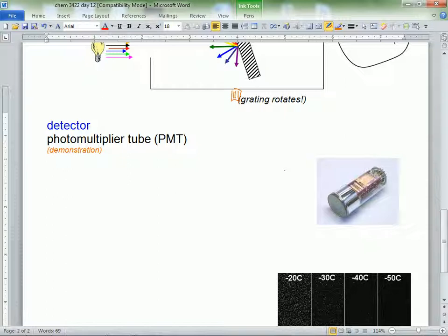A photon comes in, maybe kicks out a couple electrons. But electrons have what charge? Negative. So you can see it right there, there's the first one. It's roughly maybe a positive 100 volts or something, right? They come in there and hit that, but it's coated with more of this stuff, so now you have some more electrons. They get bounced, just like metal balls. Now they bounce down to the next dynode over here, which has a little higher positive voltage and more emissive material. Now they bounce down to the next dynode. You just end up getting this chain. They call it a cascade of electrons.